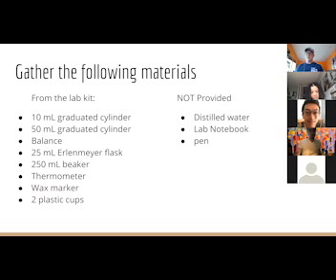One thing that isn't on here, and I would recommend everyone go get it, is this. It's called a transfer pipette, and you have some in your kit. So you might want to go and get this, because it is really hard to pour precisely 7 mils of water into this. It's basically impossible to accurately pour 7 mils of water into this without going over or under. And then you're trying to dump some out. Oh, that's too little. And you're trying to pour some in.